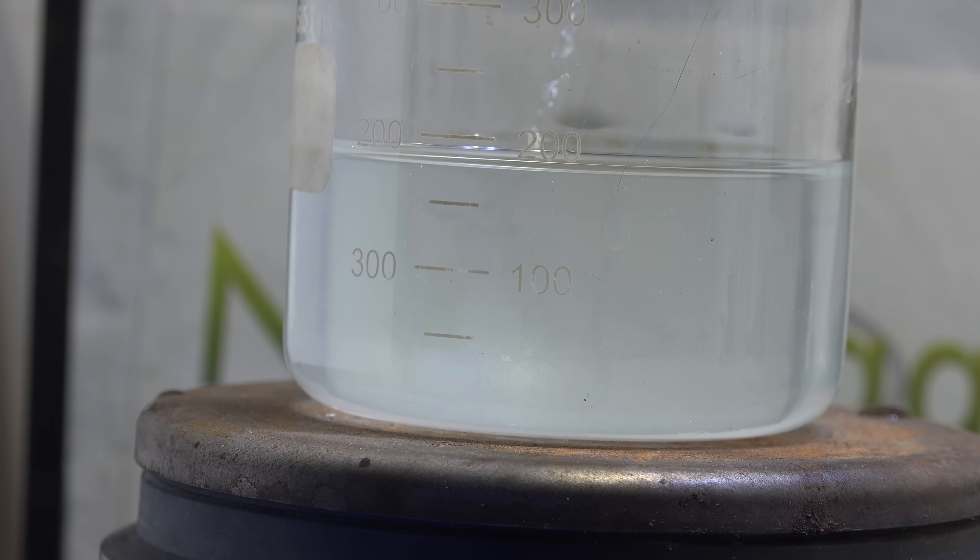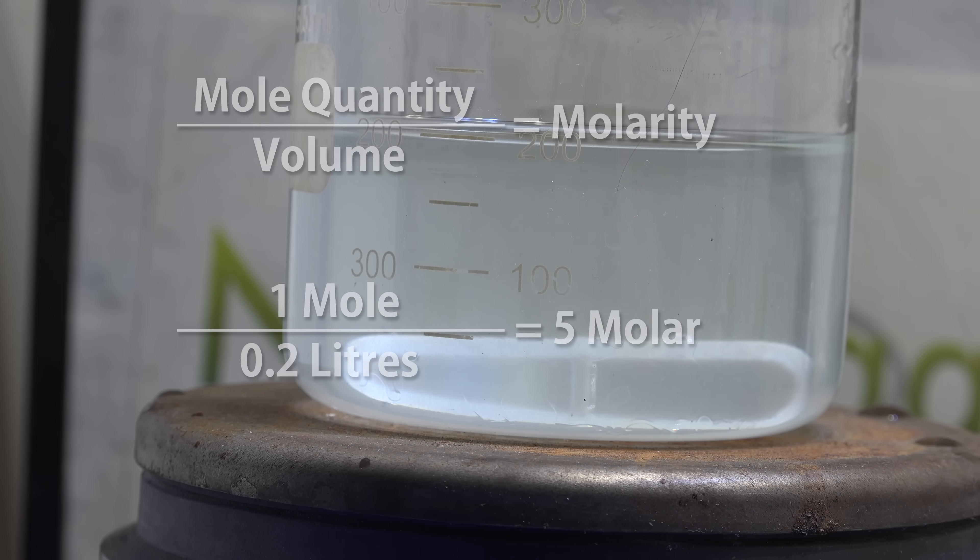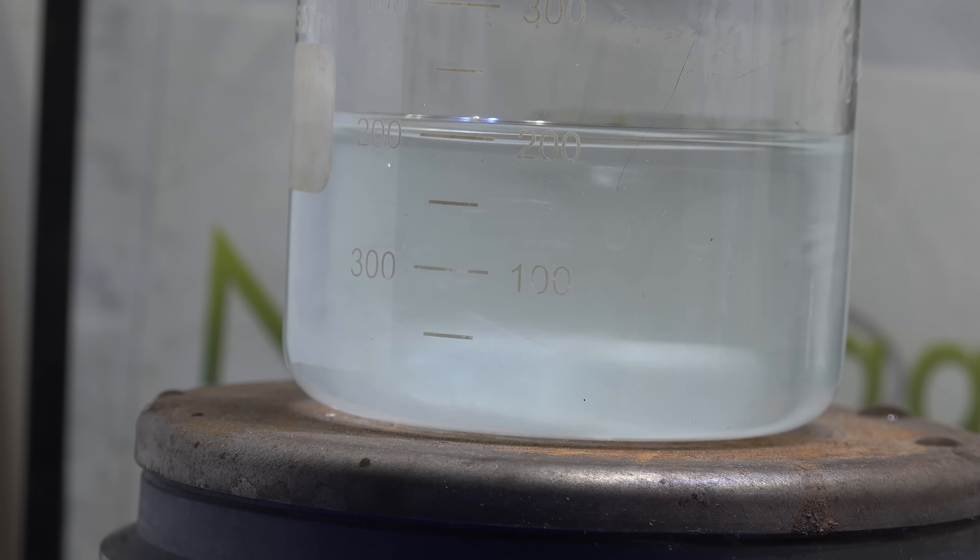To standardize the concentration, top the solution to a known volume and then divide that from the molar quantity to get the molarity. In my case, I'm topping my solution to 200 milliliters of volume. Since I have one mole of sodium silicate, I divide that by 0.2 liters to get the concentration of 5 molar. Be sure to stir your solution to homogenize it.